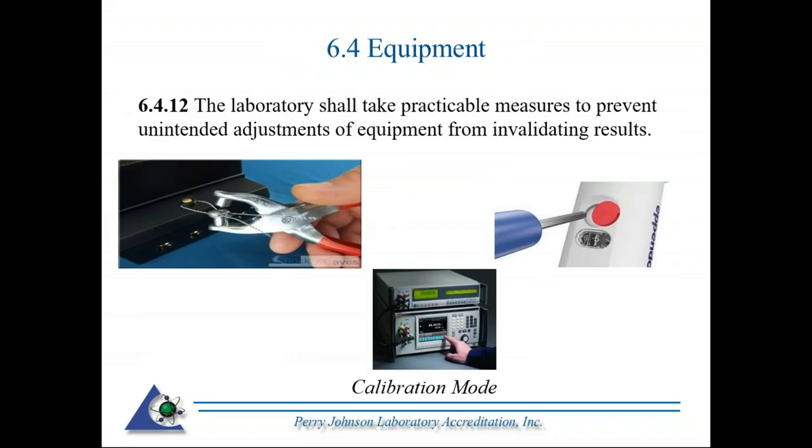Nothing new here. The laboratory shall take practical measures to prevent unintended adjustments of equipment from invalidating the results. So equipment can be adjusted. Of course you don't want that to happen during use. You don't want someone to get into the adjusting cavity and make an adjustment. The integrity of the traceable calibrations would go right out the window.